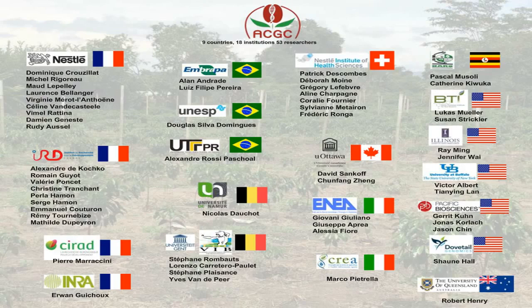Dr. Ho, this one is for you, and I'm not sure which slide it applied to. Is this technique applicable to plants only? Well, absolutely, we can. Plants is, to be honest, one of the most challenging things because, as Susie has mentioned, there's all these homologous regions. We have had success with mammals as well, as you can see from the slides, fish and reptiles. They are generally a lot easier to assemble and put into chromosomal level assemblies. So absolutely, yes.